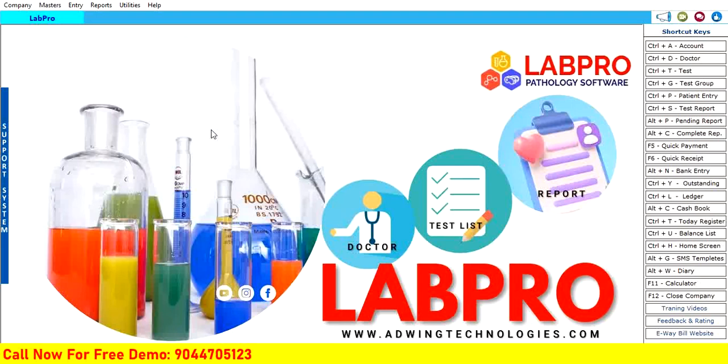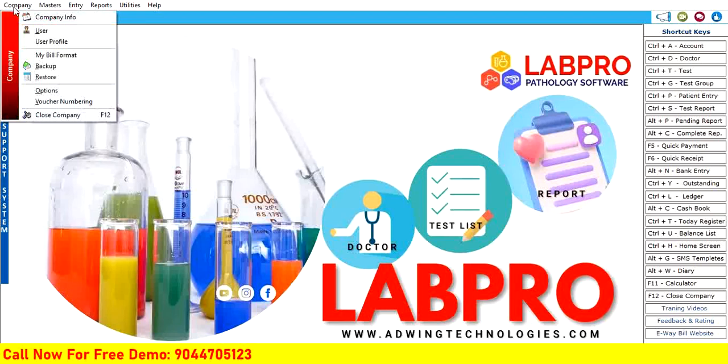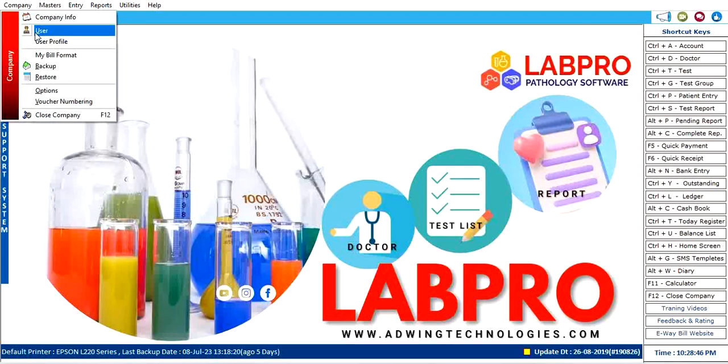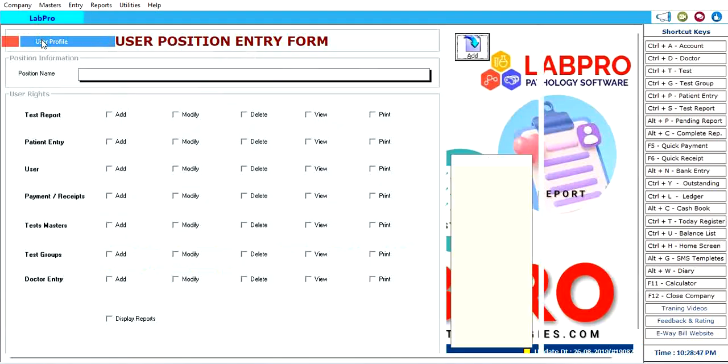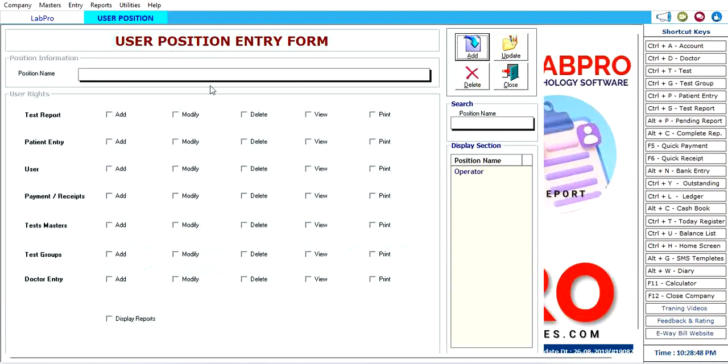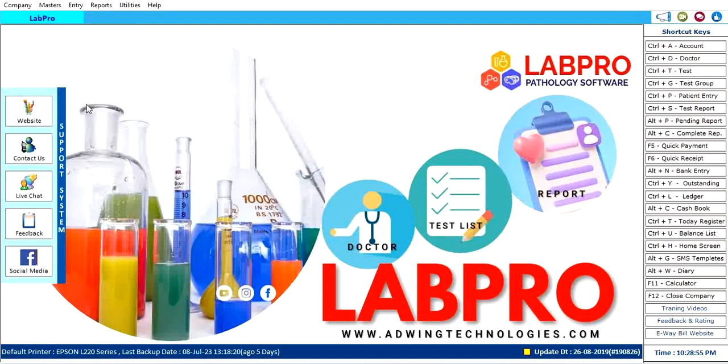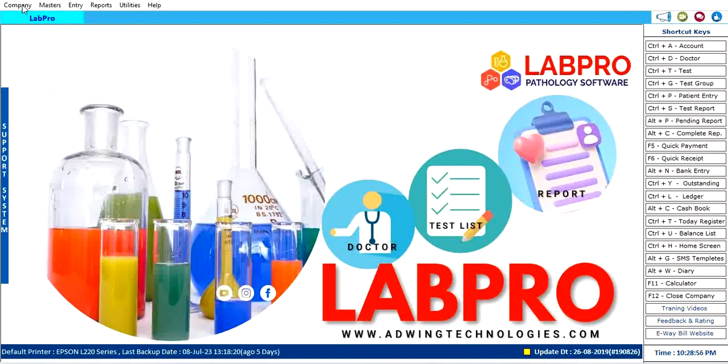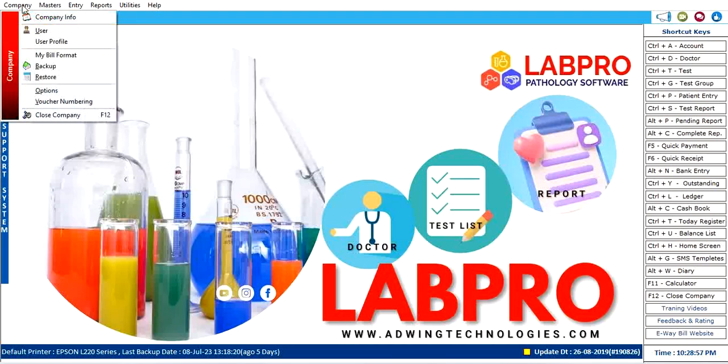First of all, you need to manage users. If you want to use pathologist on the panel, you have to manage user and user profile. Here you have to give some permissions to add, modify, delete, or use these settings.